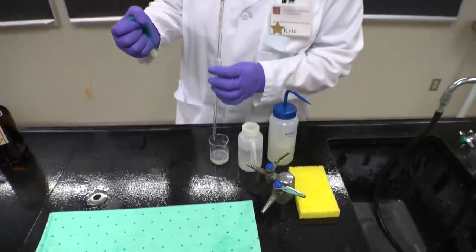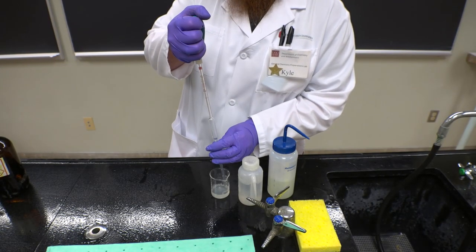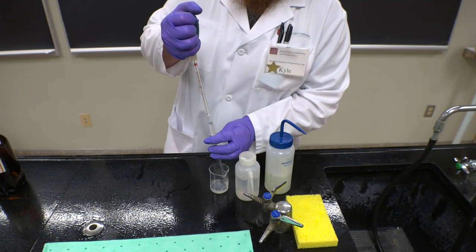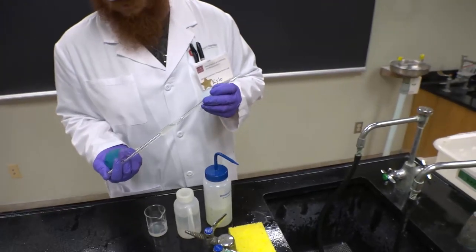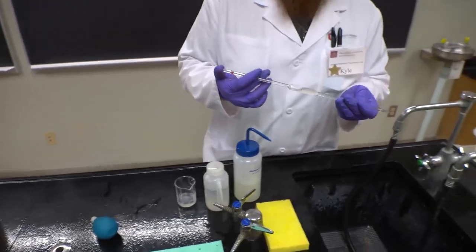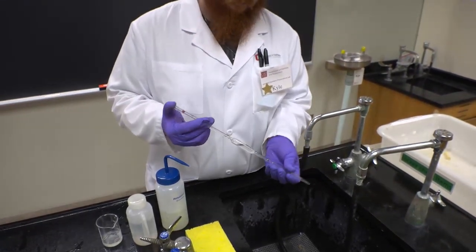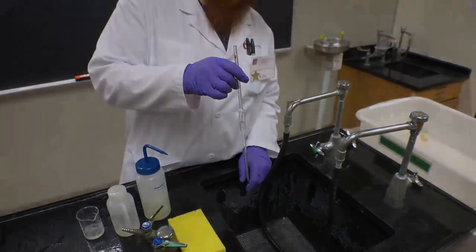To clean a pipette, you first use the pipette bulb to pipette some detergent solution into the pipette. After, you want to stopper the end with your thumb and rotate the pipette to coat the inside with the solution. Once that is done, you empty the pipette into the sink and proceed with your rinsing steps. 3 rinses with tap water and 3 rinses with DI water.